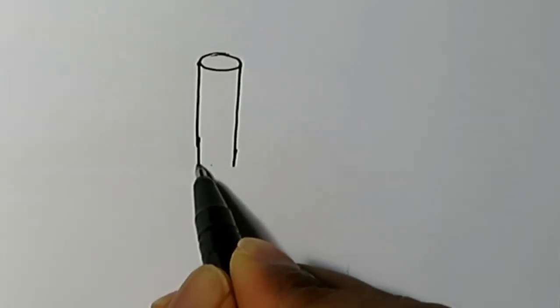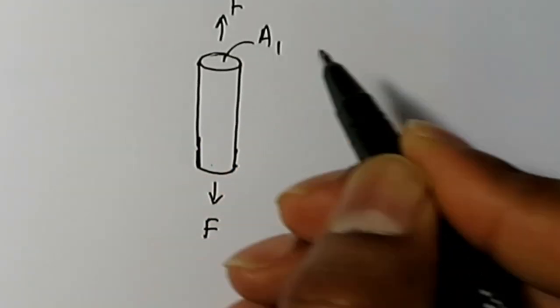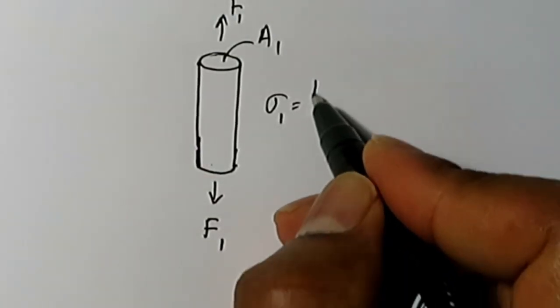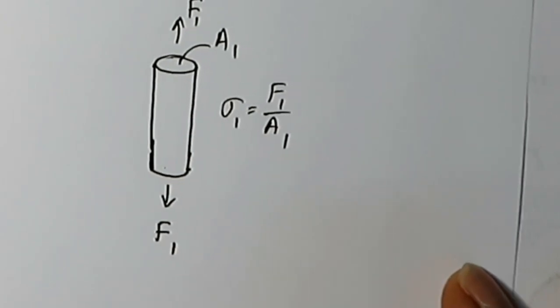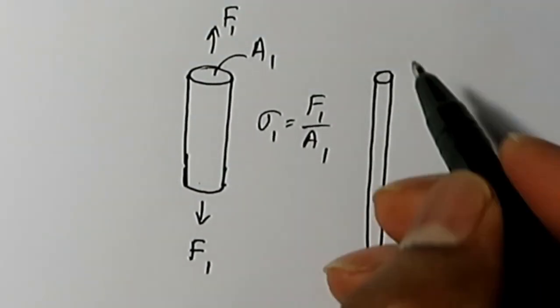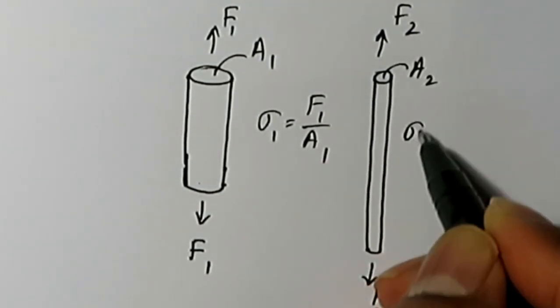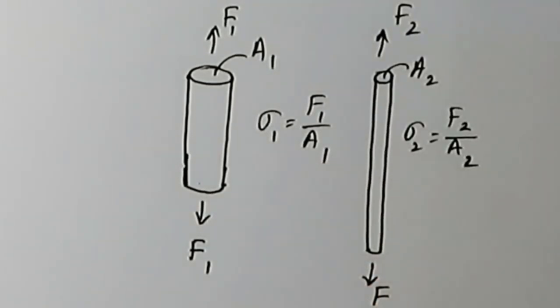For example, if we are conducting a constant stress test, for example, creep test at a given fixed stress, and we are experiencing large strain, then we should know that the cross-sectional area is also changing as the material is getting more and more strained. So therefore, it is very important that we change the load so that we can maintain the stress constant.